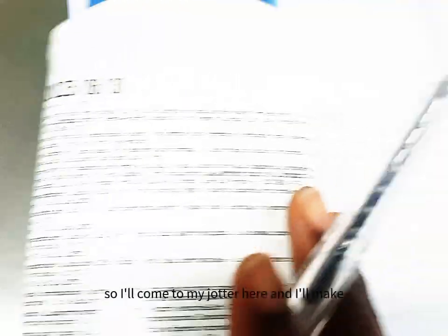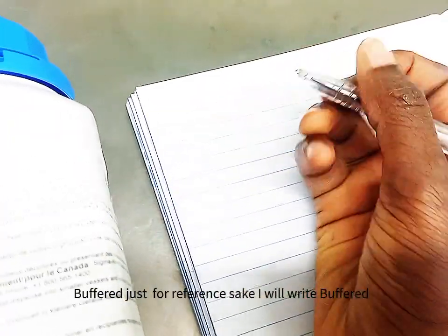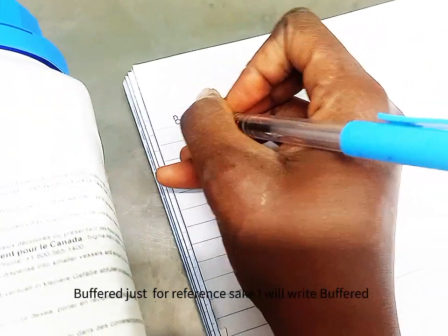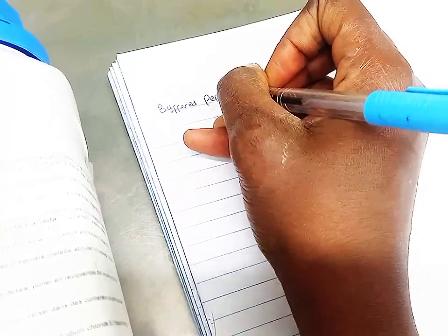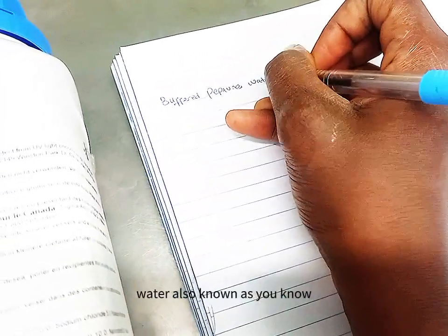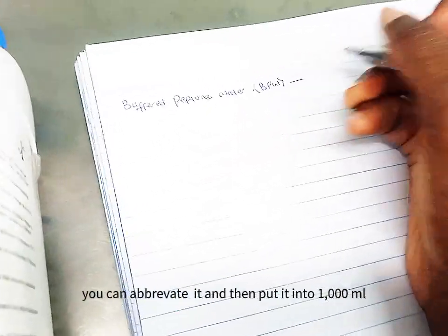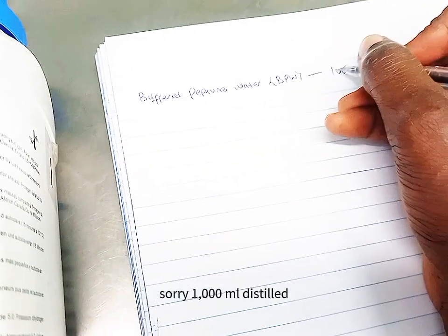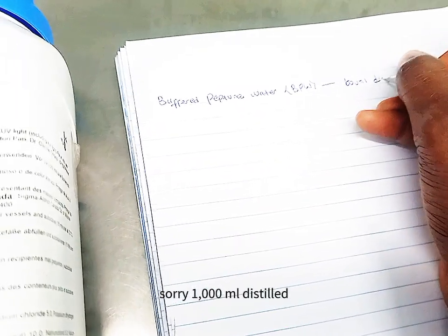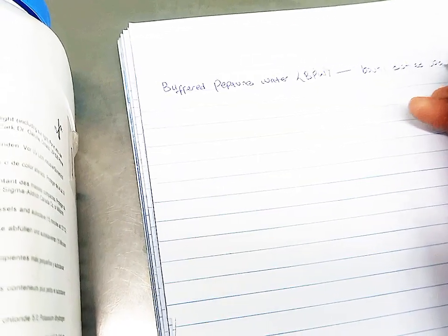So I'll come to my jotter here and I'll say, okay, buffered peptone water, you can abbreviate it, into 1000 ml distilled water.